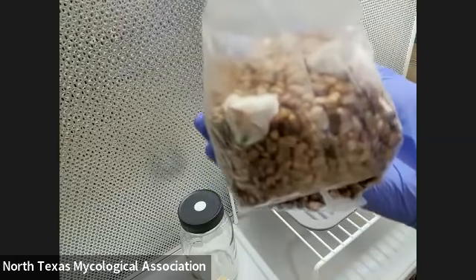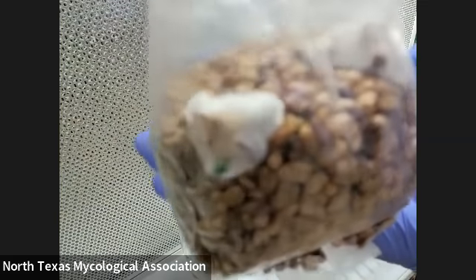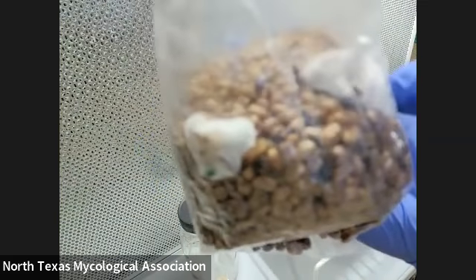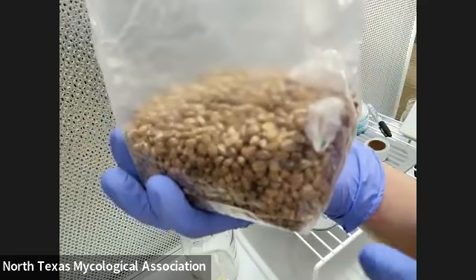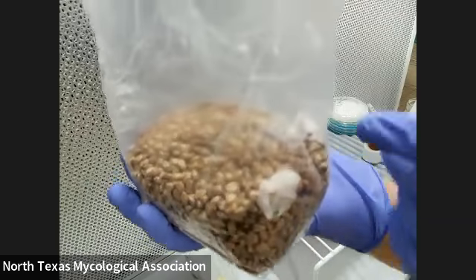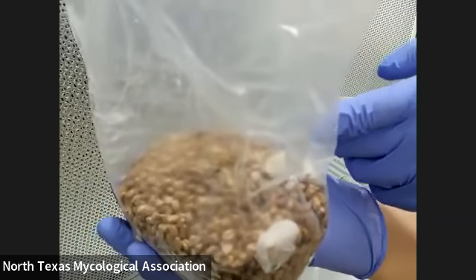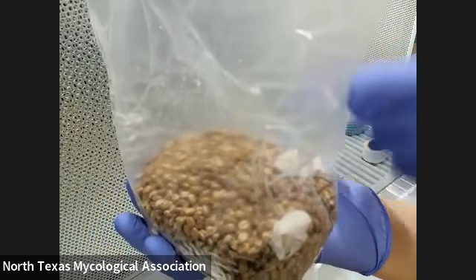You see how the grains — the agar pieces — the mycelium is jumping off onto the grains. After a while, I'm going to let it colonize maybe like 30% of the grains, then I'm going to shake it up to mix it, so it's going to colonize the bag quicker.